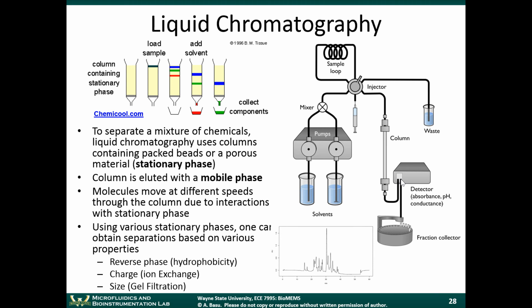As you know, molecules absorb light. So if you shine light into a certain area of the channel, when the proteins or some other molecules are passing through there, they will absorb some of the light. That changes the light signal. So that's an absorbance detector. There's other detectors as well. But the detector is what generates this chromatogram.